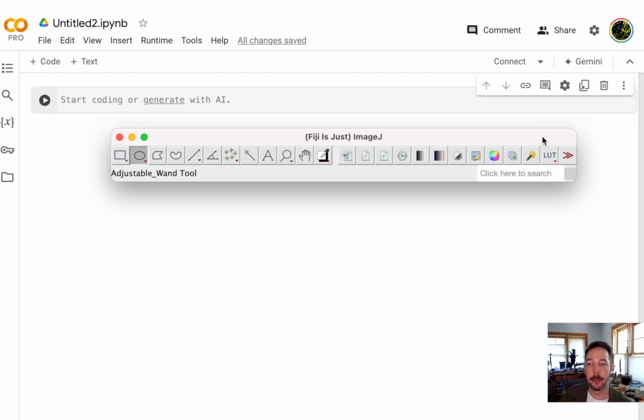And it's difficult at first, I think, for people because you're just working with text and you don't have this visual feedback, but there are ways to get visual feedback, which I'll show you. But really these tools work together. So think of Fiji as a way of interacting with your data, exploring results, or looking at data before it's used in Python. And then think of Python as a way of using these state-of-the-art tools and creating high throughput scripts, or even just knowing how to use other people's scripts to process data efficiently.